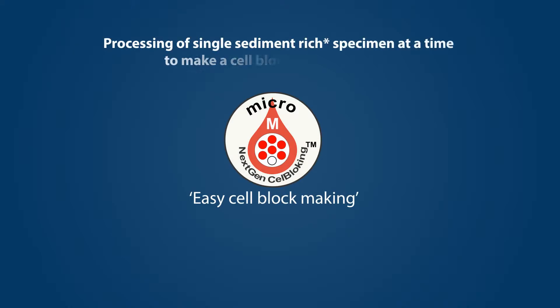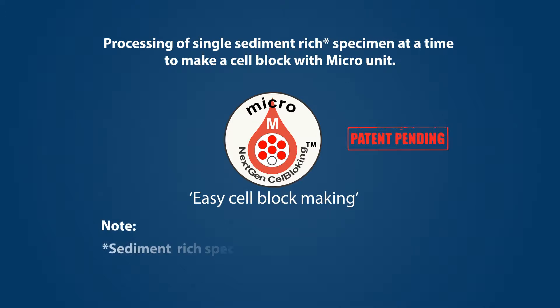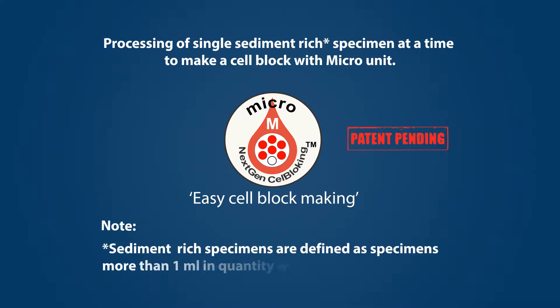Processing of a single sediment-rich specimen at a time to make a cell block with a micro-unit. Sediment-rich specimens are defined as specimens more than 1 ml in quantity with more than 50% tissue crit.